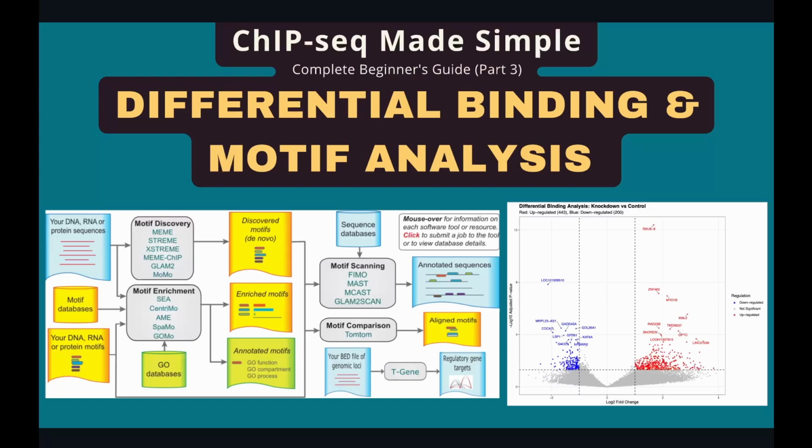The tools we're going to use for differential binding analysis are basically the same tools we use for differential expression analysis, due to the fact that both peaks and genes are genomic regions, and we're just comparing the number of reads that fell into these regions. In the same way, we can identify up-regulated peaks and down-regulated peaks, and these differential peaks can then be subjected to motif analysis. Sounds easy, right?